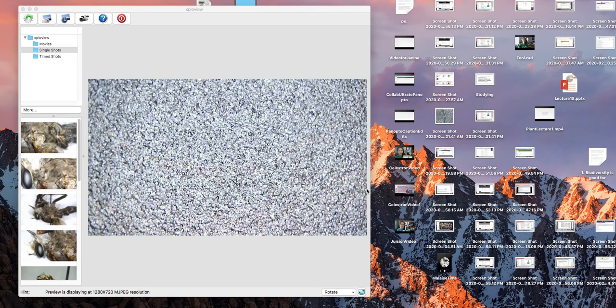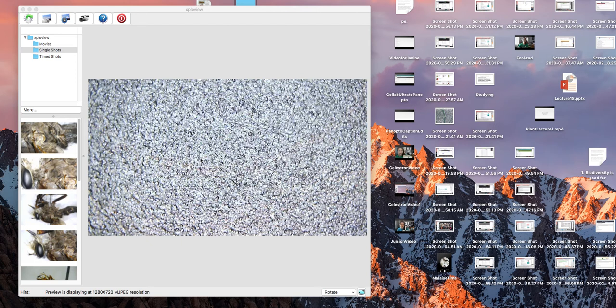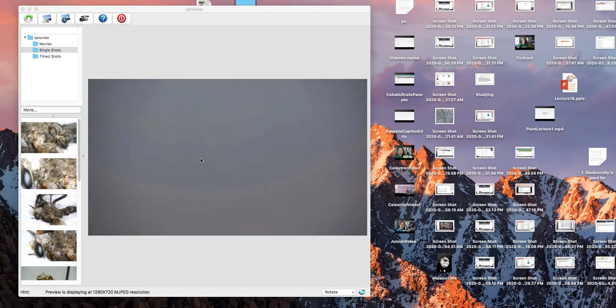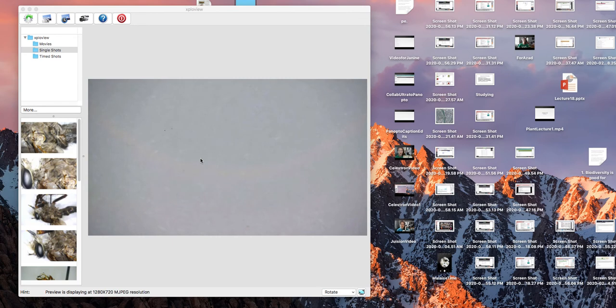One of the downsides of this microscope is that it has this really strangely reflective coating on the stage. So what I'm first going to do is put a little strip of white paper there just to cover that up. You can see that makes a remarkable difference.